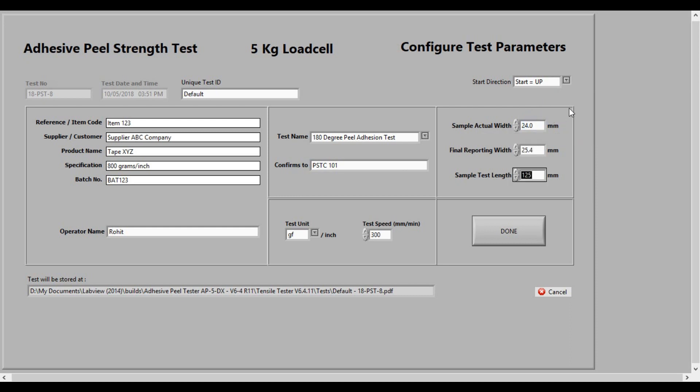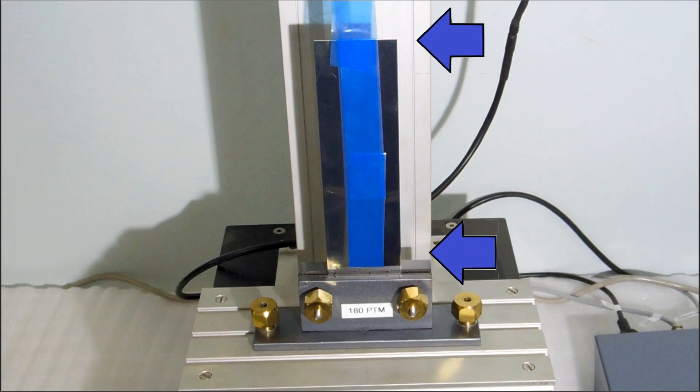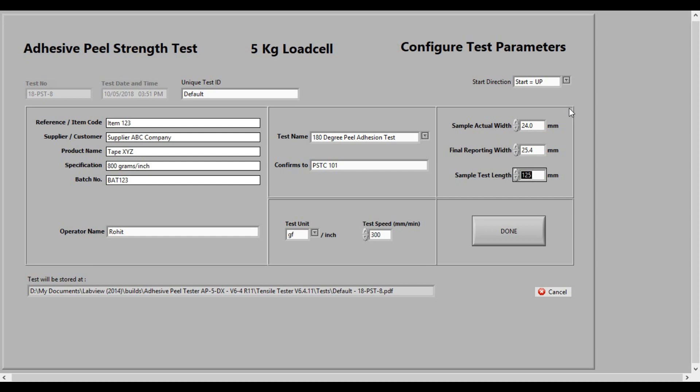The sample test length should be a little less than the real length available on the panel, minimum 75 mm. Press done and select continue.